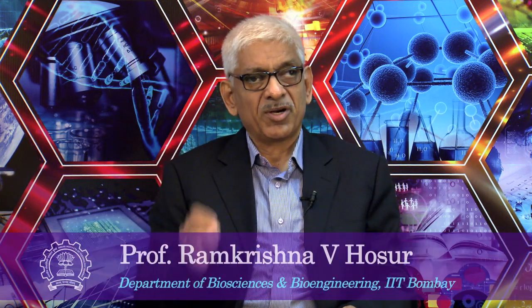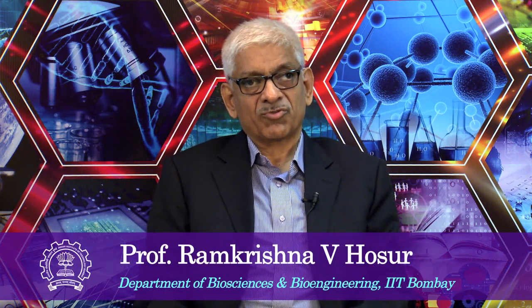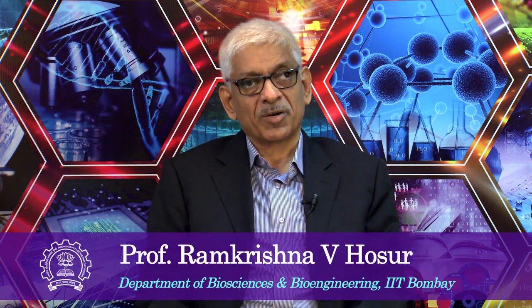We have been discussing two-dimensional correlation experiments. This was the COSY experiment, the first experiment to be developed, and the most fundamental of all of these correlation experiments. Let us do a quick recap of what we did in the last class.